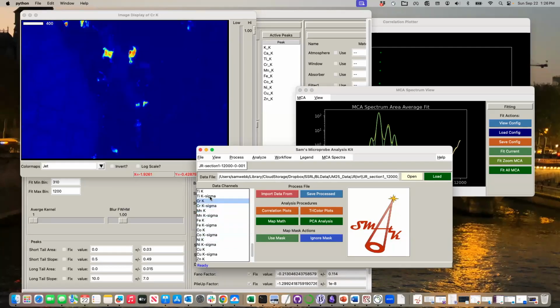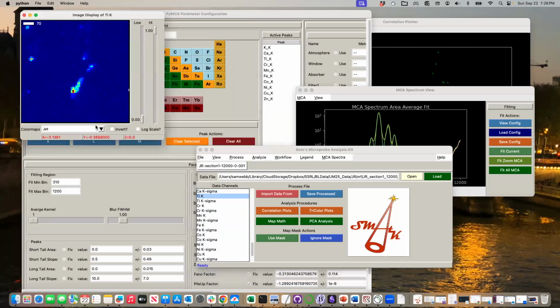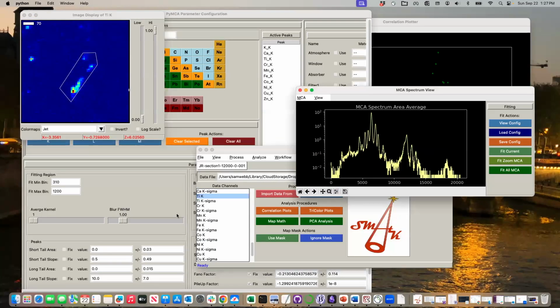I'm going to pretend I'm really worried about this titanium peak. Kind of actually am, but I remembered something just now. So I'm going to zoom in over here. We picked some random area around one of the more intense regions, right? Well, what does this region look like? We had a lot of air here. So I'm going to zoom on this guy here, use our shift select, and I'm going to choose the MCA down in my lower window here. And there's our updated MCA, right?